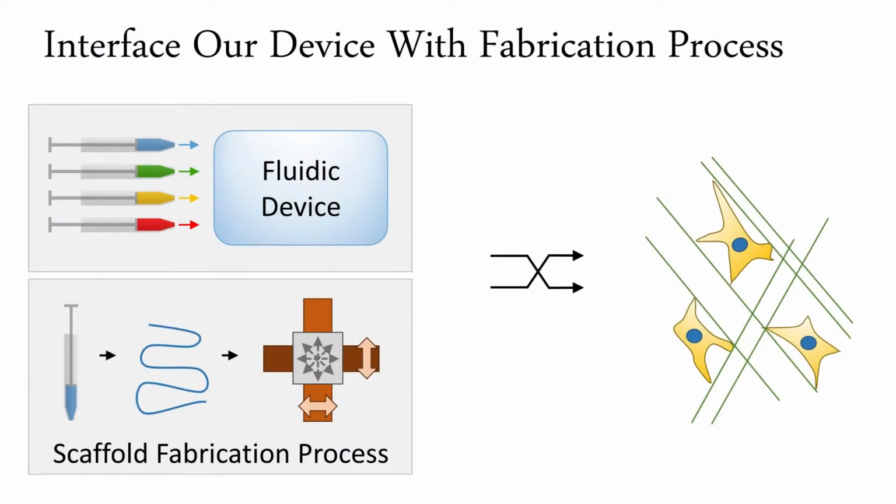After characterizing the fibers generated by the devices using confocal fluorescence microscopy, we determined the limitations of each and we chose the best one to move forward with. Our next step was to interface our fluidic device with our existing fabrication process.